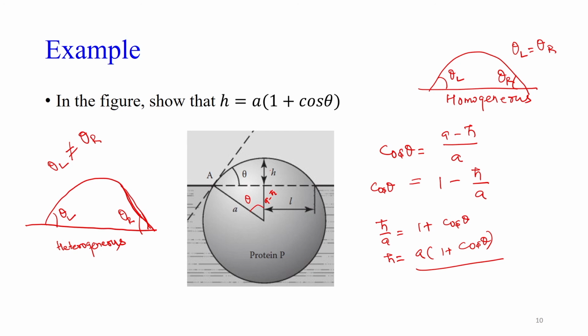To analyze this, we have to fit different circles, because the whole shape cannot be part of one imaginary circle. One circle will be like this: you can fit one circle to the left side, and at the same time fit a second circle to the right side.